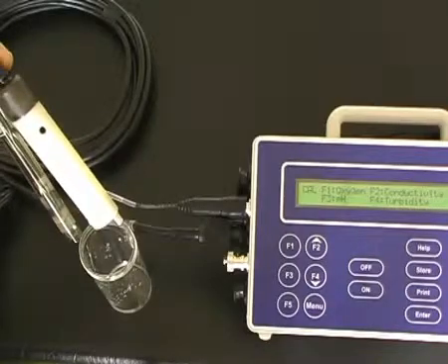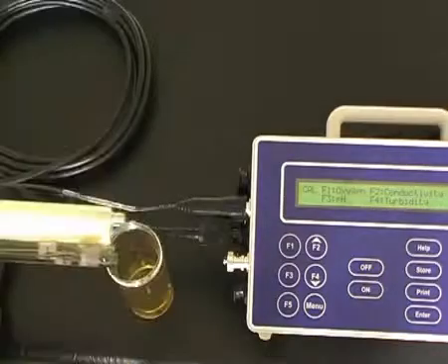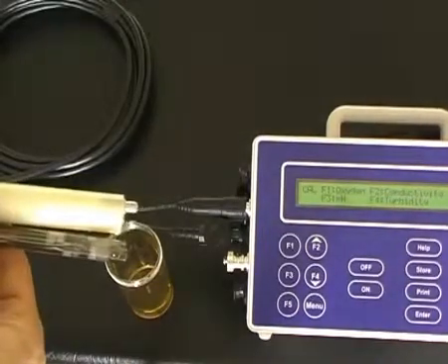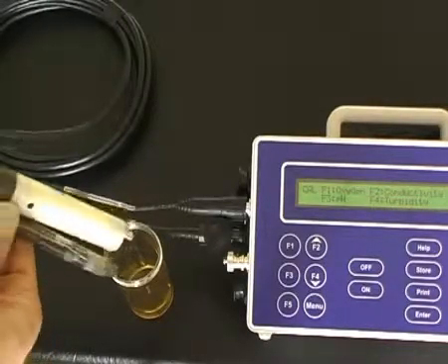Remove the sensors from the pH 4 solution and rinse both sensors with deionized water. Once rinsed, place both sensors — the pH sensor and conductivity sensor — in the second calibration buffer, pH 6.88, for calibration.